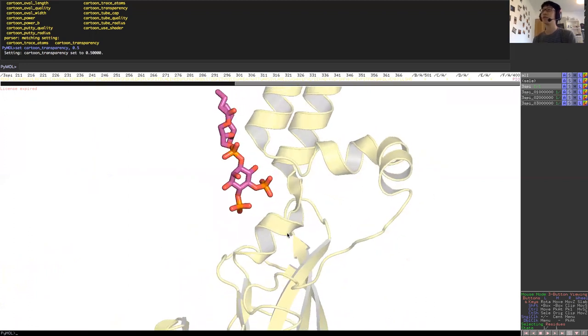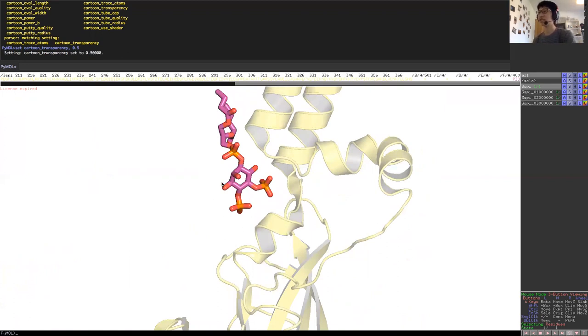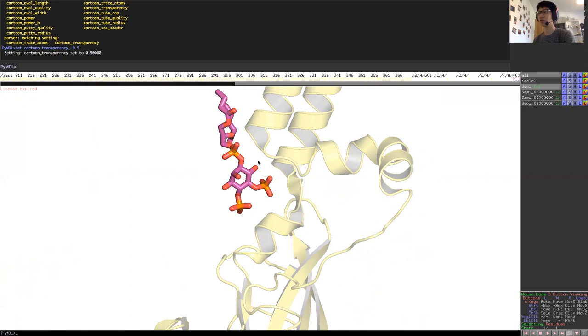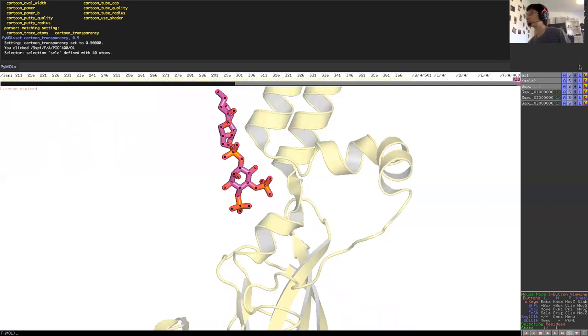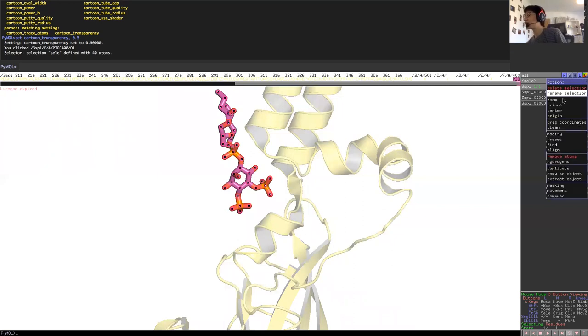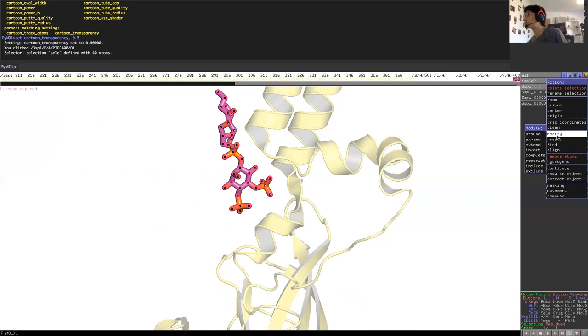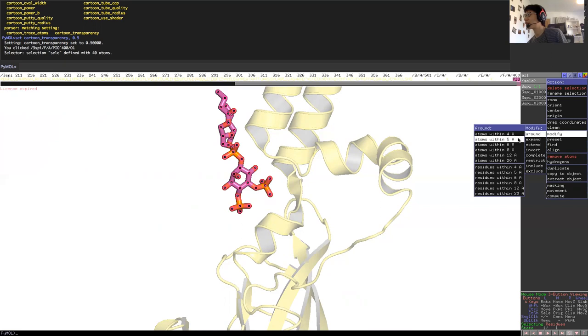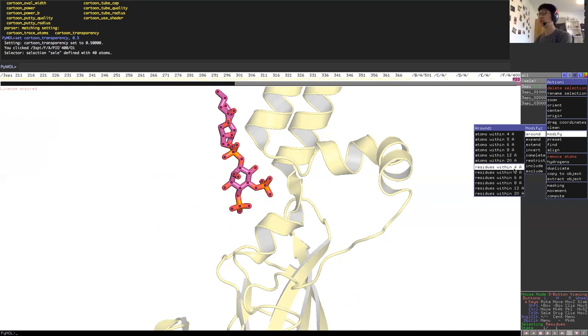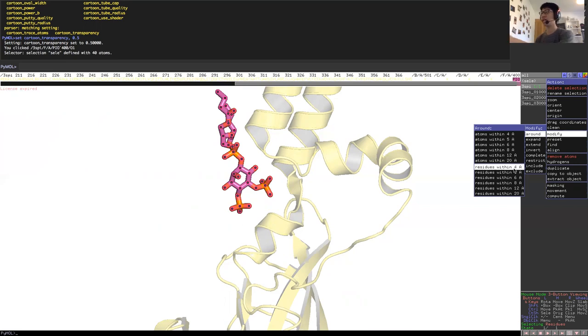My main focus now will be to look at what residue is coordinating or interacting with my PIP2-DiC8 ligand or lipid that Rod McKinnon co-crystallized with. So I'm going to click on this selection and I'm going to go for action and modify, and I would go for modify around residue within 4 angstrom. What this is doing is this will modify my selection to include residues within 4 angstrom of PIP2 that I'm interested in.